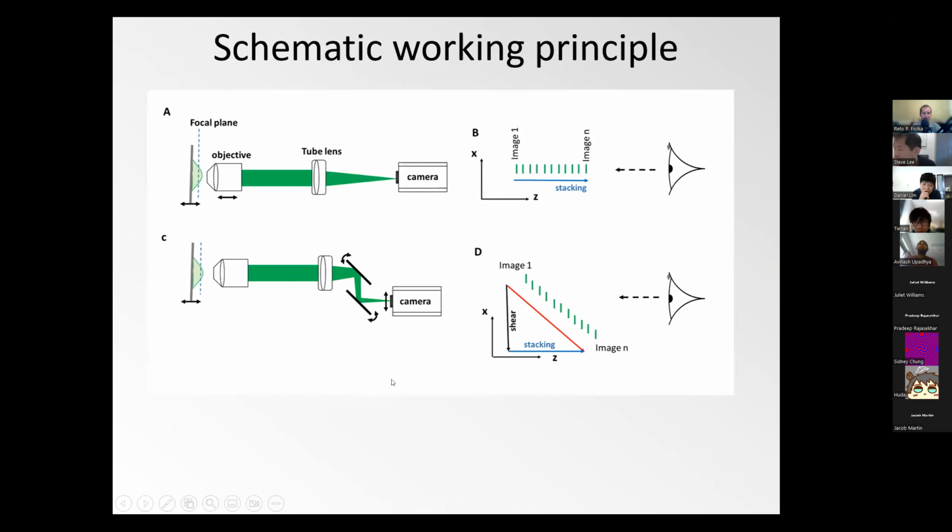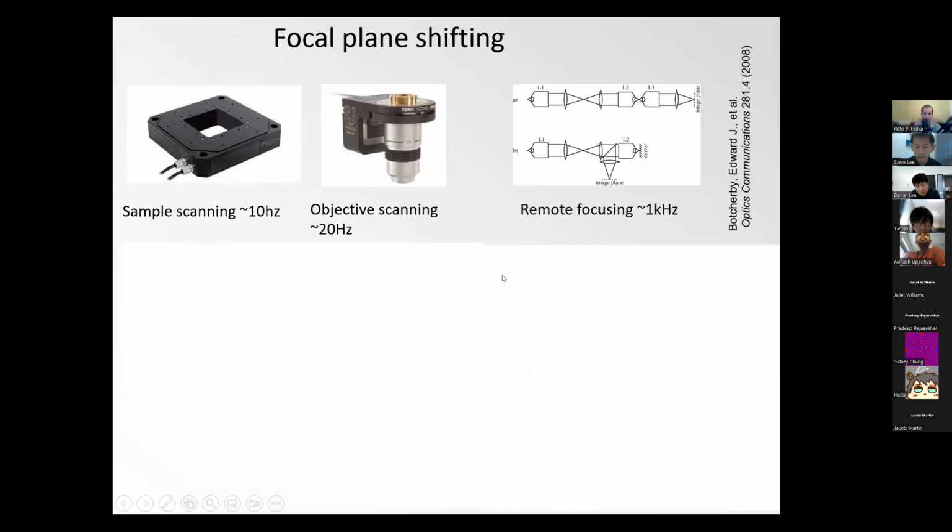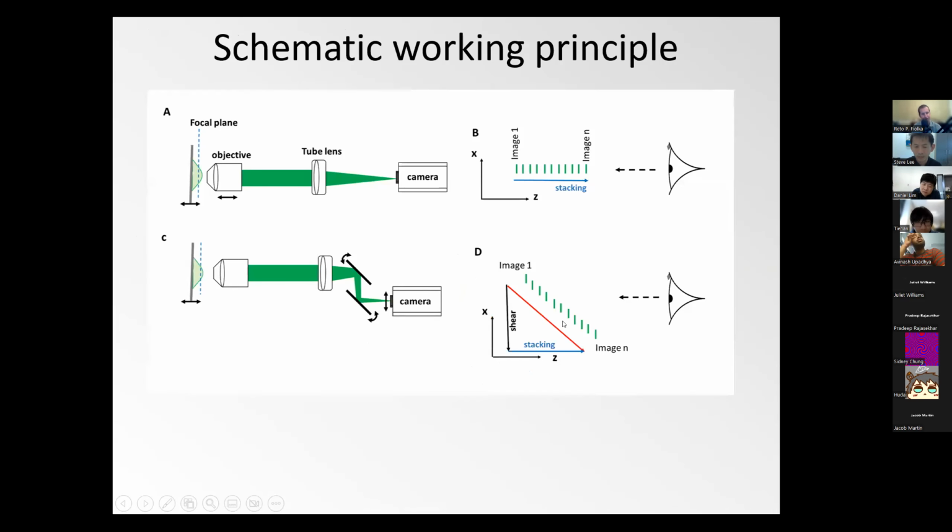So why does this have any relevance to microscopy? Because we can essentially add that shear to a normal microscope, any 3D microscope. So normally, if we acquire a Z stack, we stack the images along Z, and we look at them in the Z direction. But we could also, while we acquire the Z stack, add an optical device that also shifts the images as they come in the X direction. So we would add a shear. So we can essentially, as shown here, shear the whole 3D stack and then sum it together. And we will see why you would want to do that.